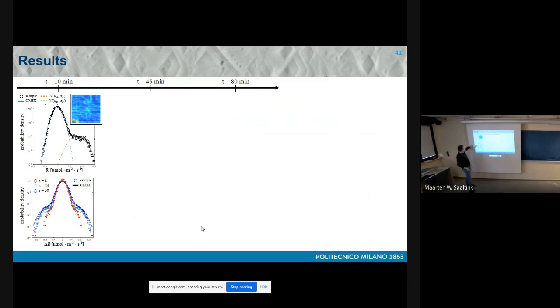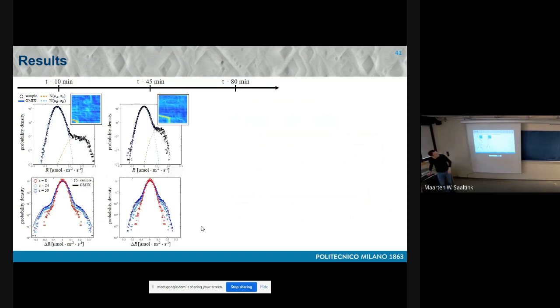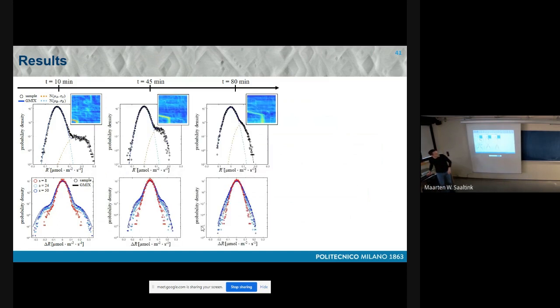And these are the experimental data, the symbols, while the solid curves are the resulting model interpreting the data at different times. And we could see that they could interpret the evolution of all these. Note that the structure of the model is always the same. The only thing which changes, of course, are the values of the parameters in time.